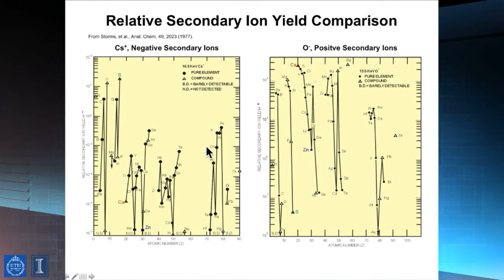And I think the thing is, it's not that these things go up and down, but it's just the magnitude that shows on the y-axis here. You'll notice that these ion yields are varying by orders of magnitude. These are log scales here, right? And we're seeing many orders of magnitude.